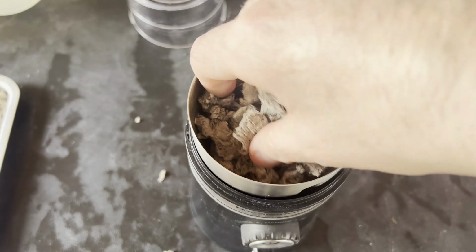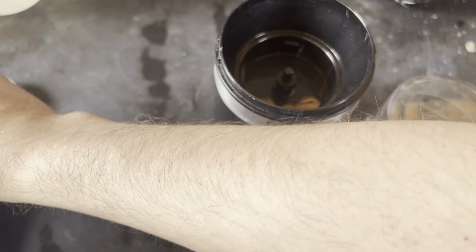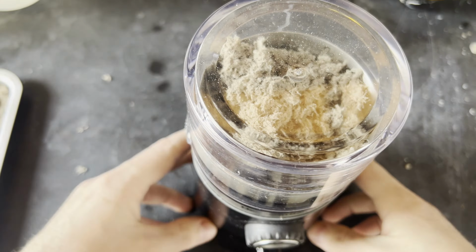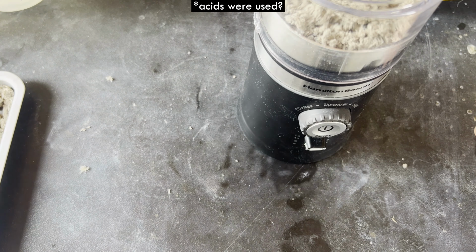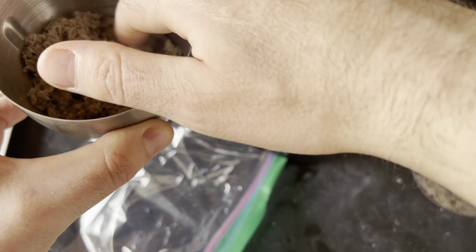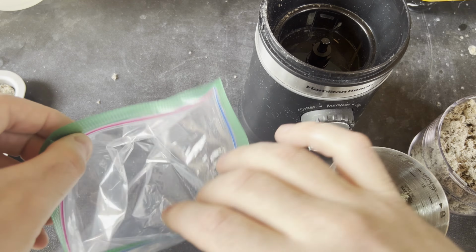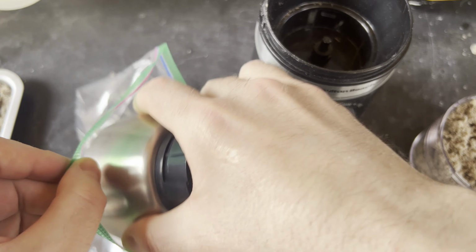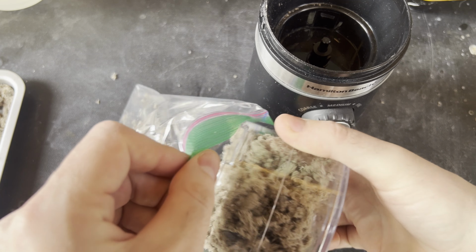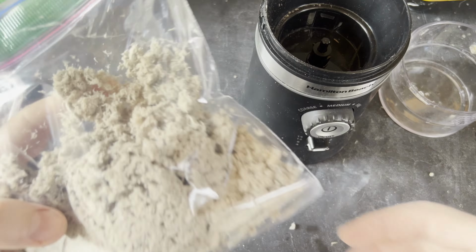I don't remember exactly how asbestos was purified for use as an analytical filtering medium after the originally developed procedure, but I know at least hydrochloric acid and maybe later nitric acid was used. Sulfuric acid wasn't used because some of the impurities had sulfates that are insoluble, so they would just contaminate it further, and chlorides and nitrates are generally extremely soluble and easy to remove by following acid boils with copious water washings. I'm not using it for analytical work, so I didn't boil it with nitric acid, just water and dilute hydrochloric acid.